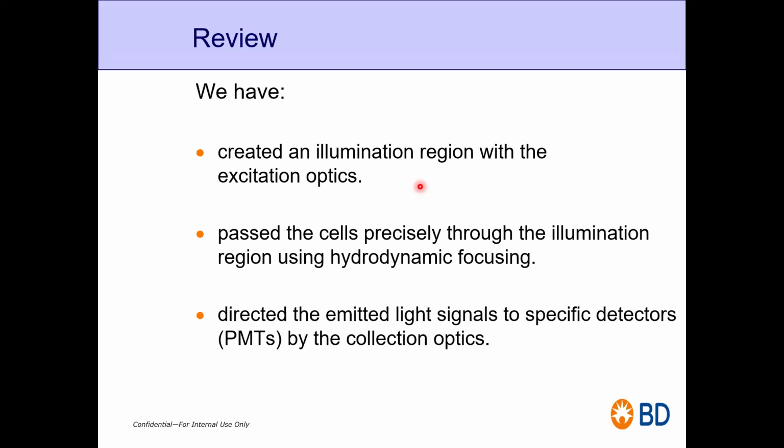It amplifies the data, right? You give an amplicon and it amplifies that particular amplicon. Same goes for PMTs. When one photon hits it, it converts that photon to electrons, and not just converts it, it will amplify it. Let's say, just a vague example, one photon is hitting the photomultiplier tube, it will release somewhere around 10 or more electrons. So basically it will amplify your signal as well.